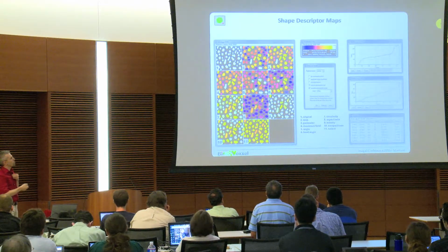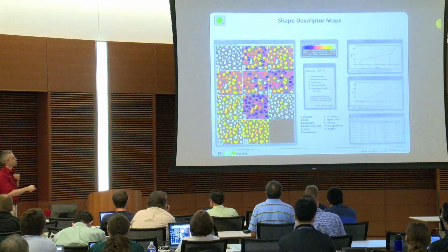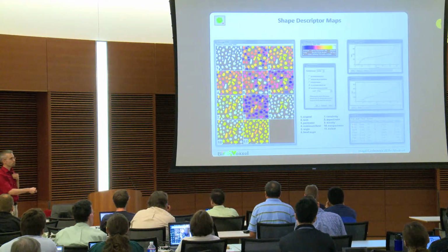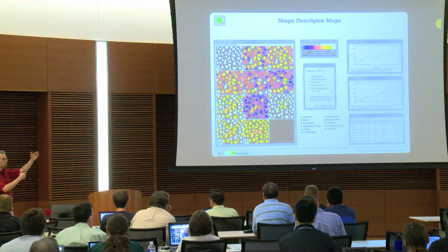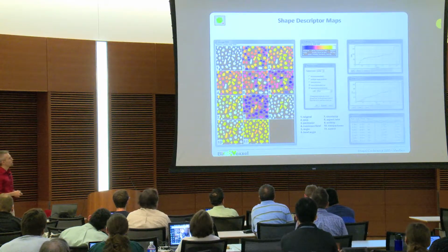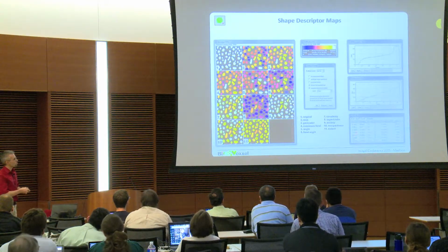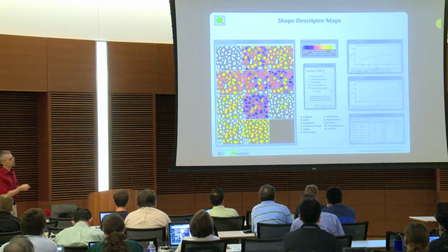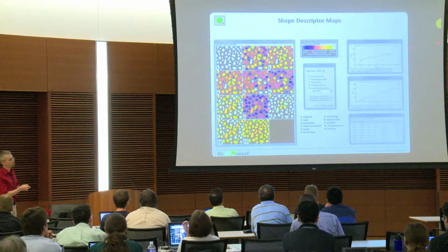And then if you want to find a specific cutoff value, you can click in those plots, which are the standard ImageJ plots, on list, and you will get the list where these shapes or whatever sizes are listed. I can show you that then. And then basically, if you figure out, okay, there is a jump here in the plot, this might be a possibility where I can cut off things.